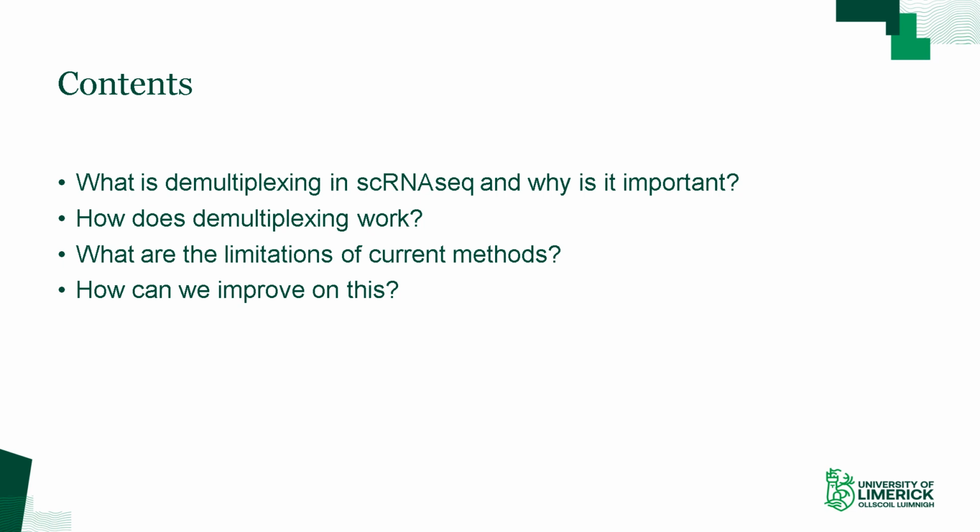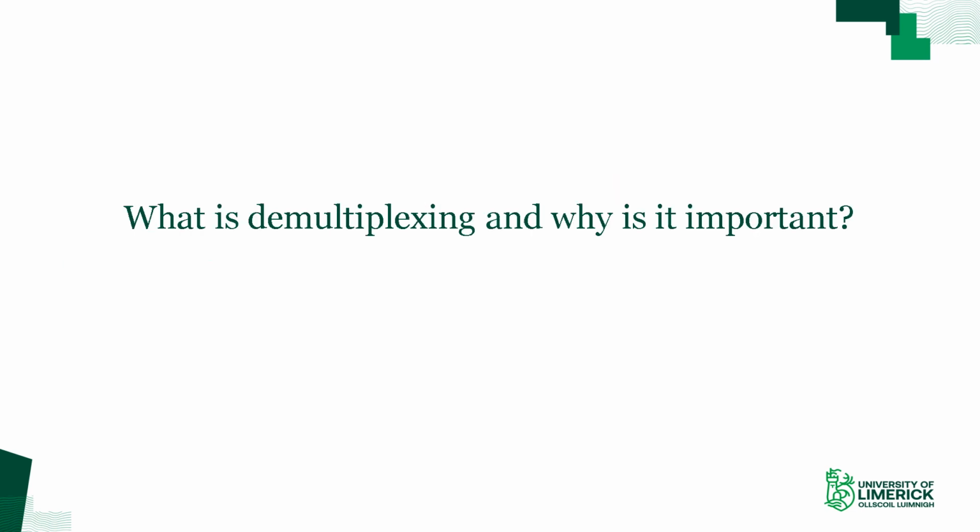So I'm going to give a quick introduction to demultiplexing. What is it and why is it important? How does demultiplexing work? What are some current limitations? And what we've done to improve on these. So first off, what is it?